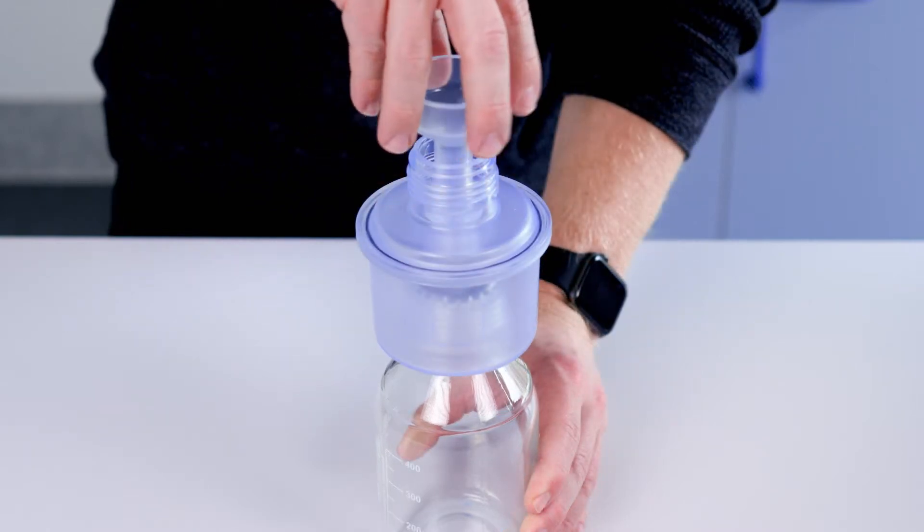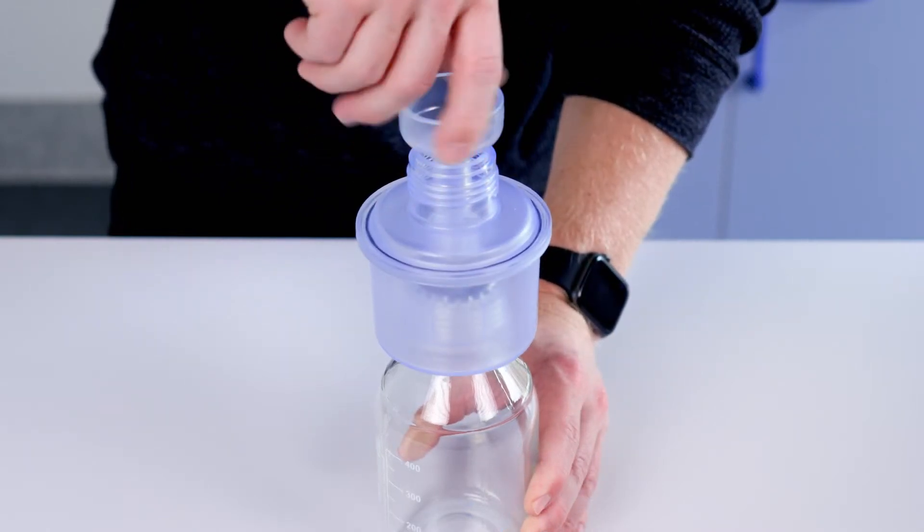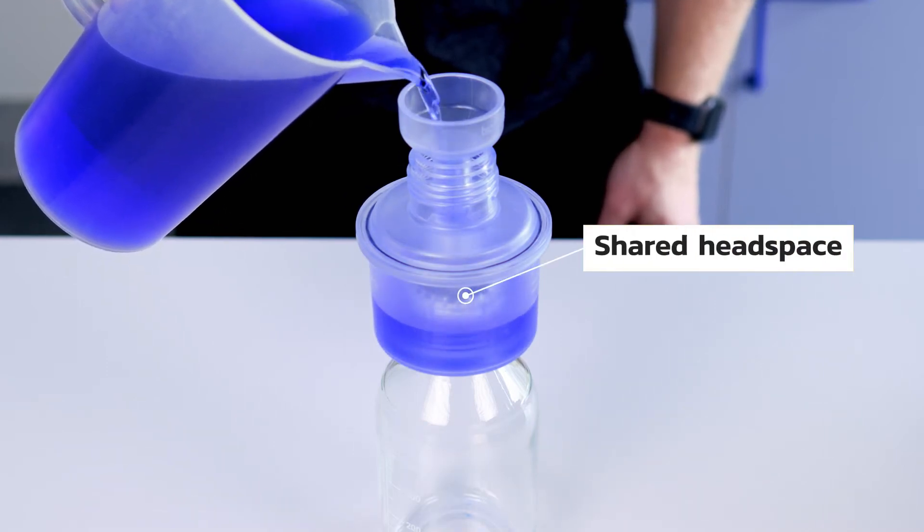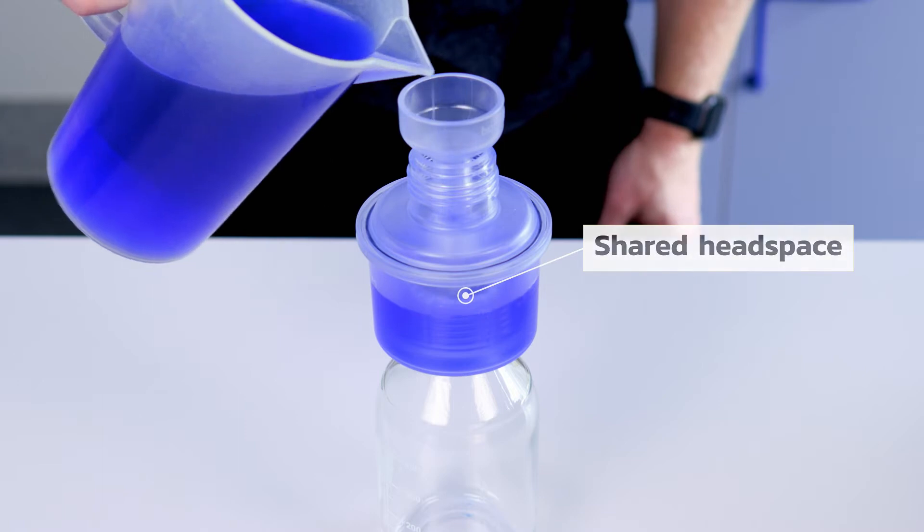In the in situ version, the gas removal part is mounted on top of the bottle instead, creating a shared head space between the gas removal unit and the incubation bottle.